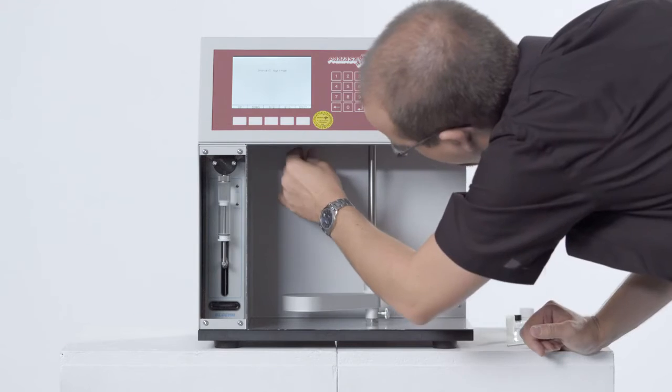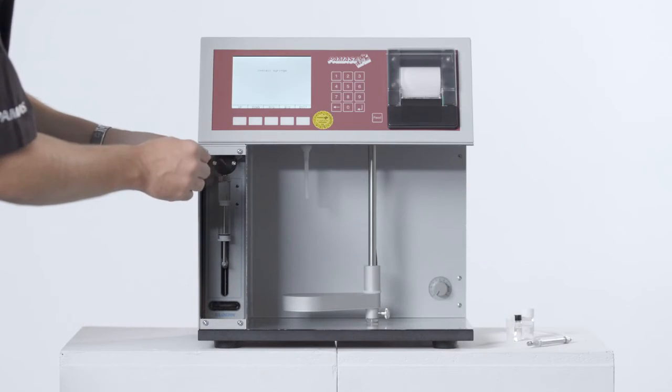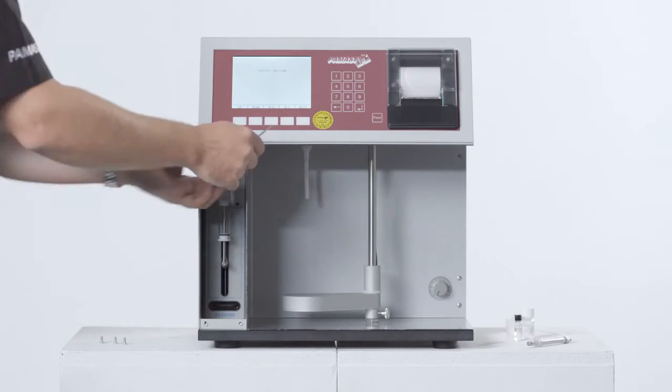Smallest sample volumes down to 100 microliters are analyzed with another sample adapter.